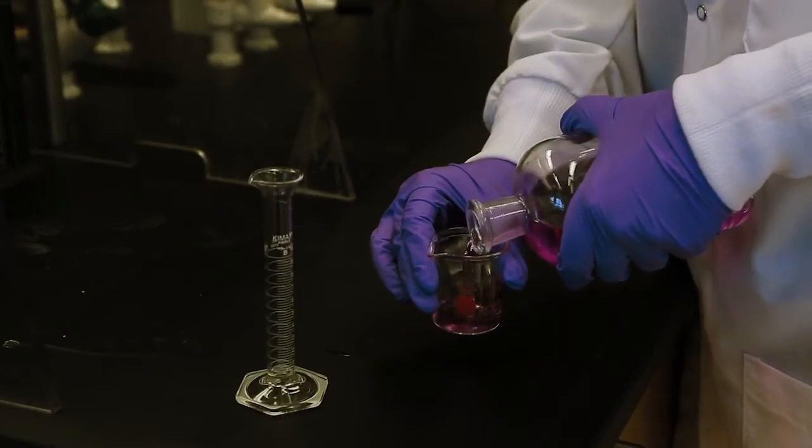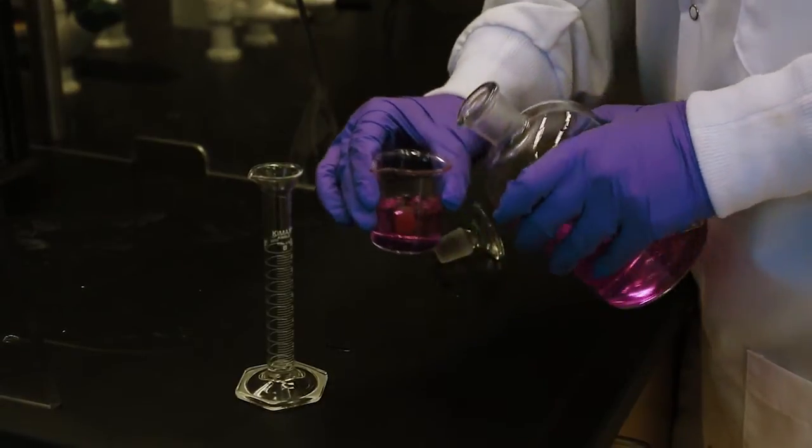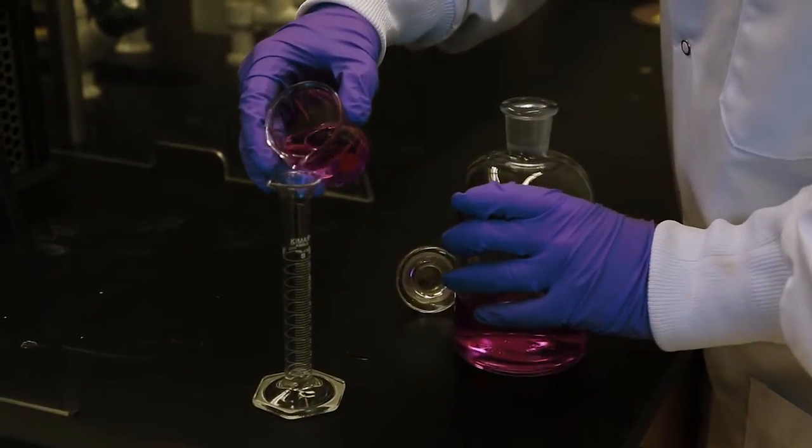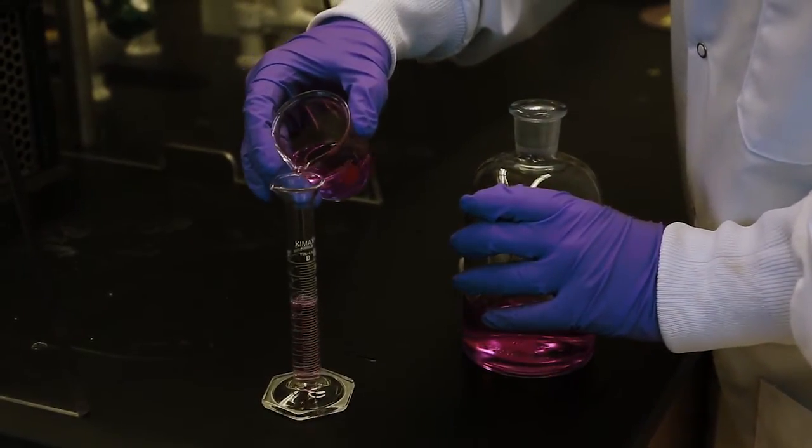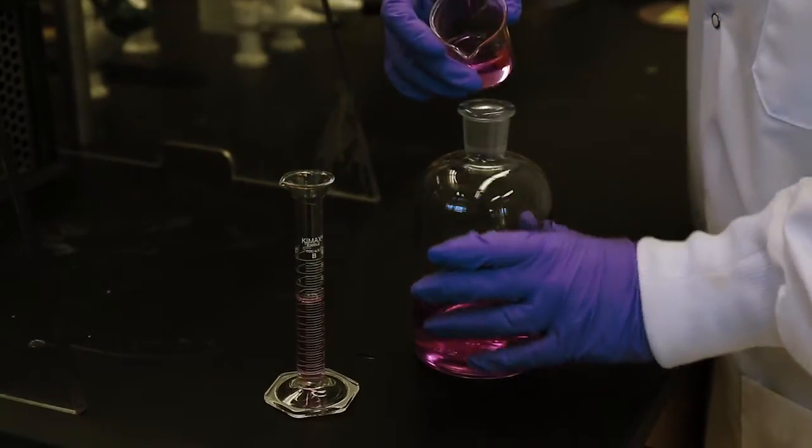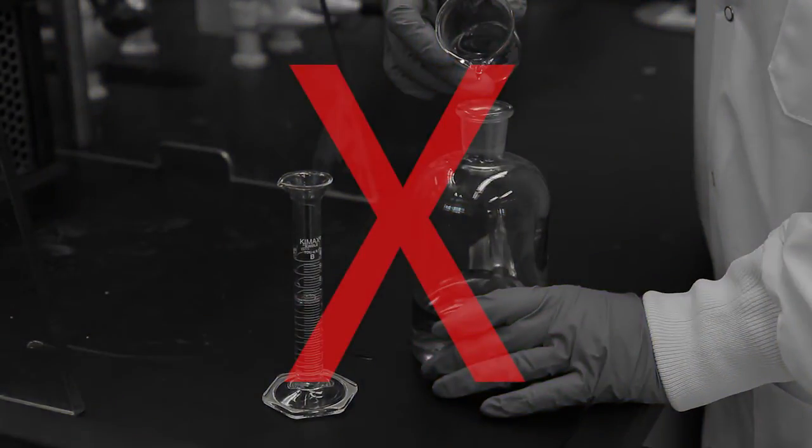If you obtain too much of a chemical and have excess leftover at the end of the experiment, do not return the reagent to the bottle you obtained it from. This excess reagent is contaminated and should be placed in the waste bottle.